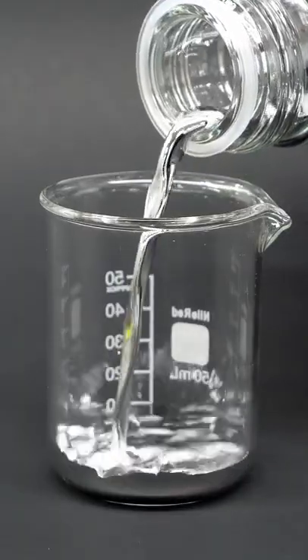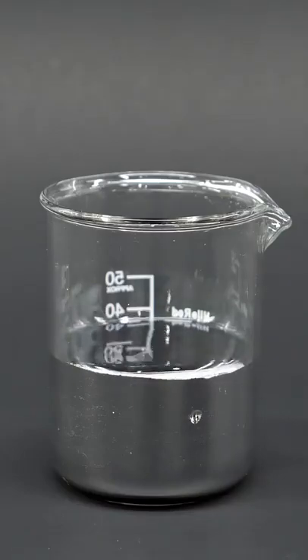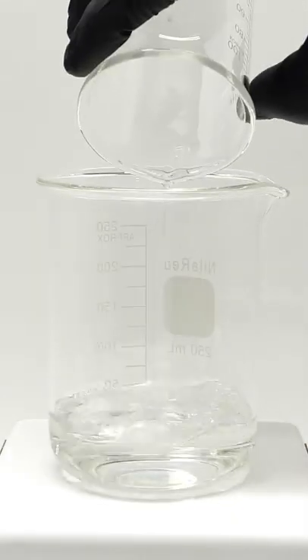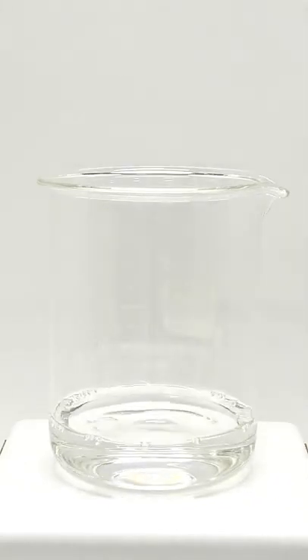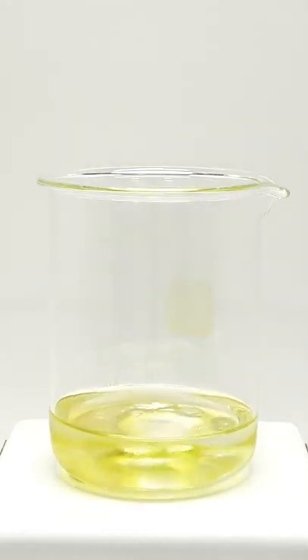This is a bunch of nice and shiny mercury metal, and I'm going to use it to do something that I think is kind of magical. To get started, the first thing I'll need is some concentrated nitric acid. Then into this, I'll add a small amount of the mercury metal.